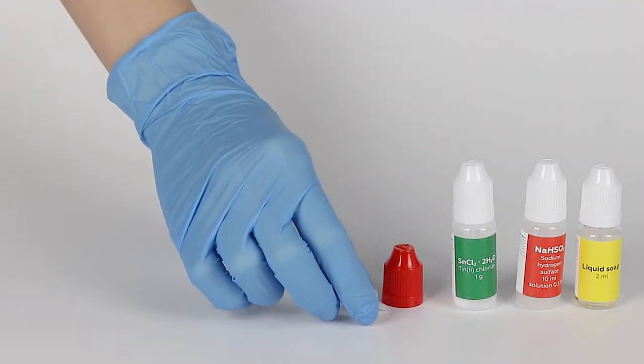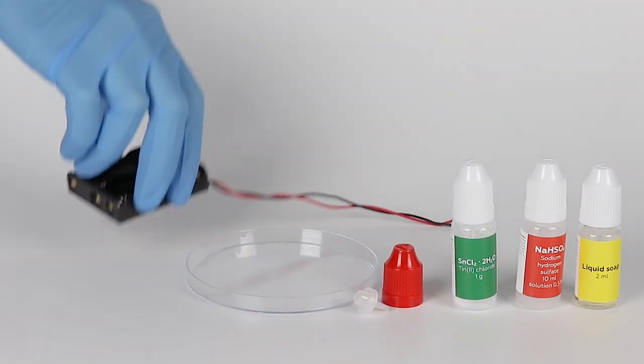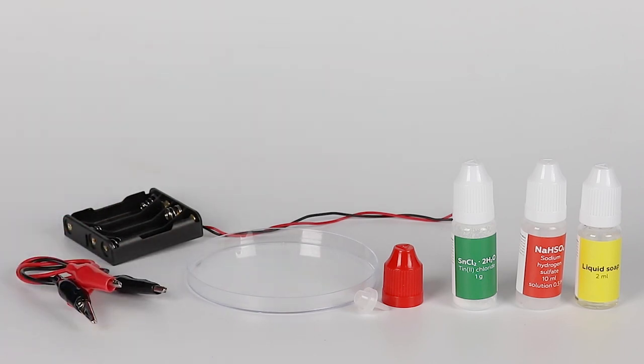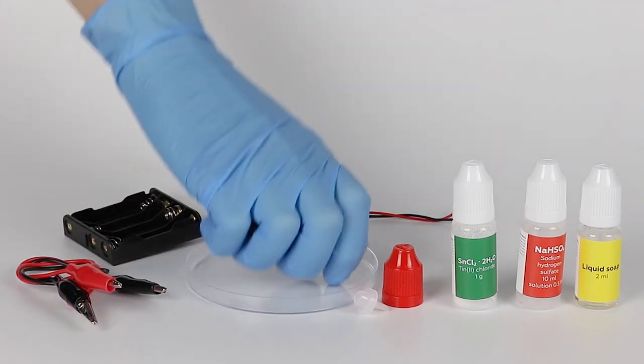For the tin dendrite experiment, you will need liquid soap, sodium hydrogen sulfate solution, tin chloride, a red cap, a tip, a petri dish, a battery holder, and crocodile clip wires. Prepare four AAA batteries in advance.